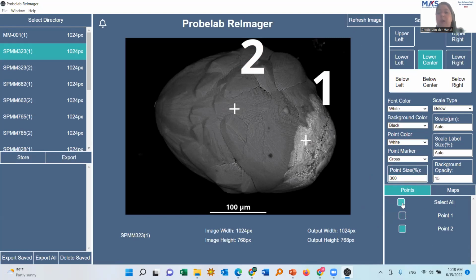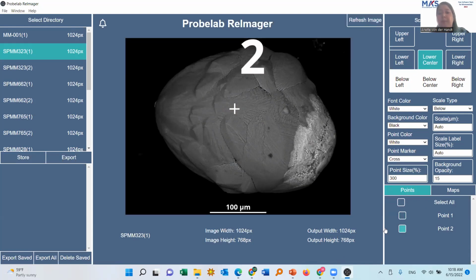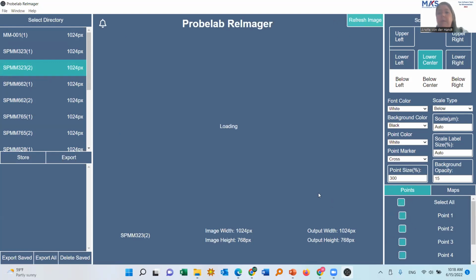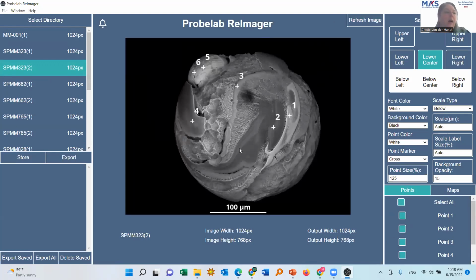We can also say, instead of all, I only want to have 0.2 displayed. And again, it remembers the settings. It's comically large, so usually we probably just want something slightly larger. We get all these different annotations exactly as we would like to have them.